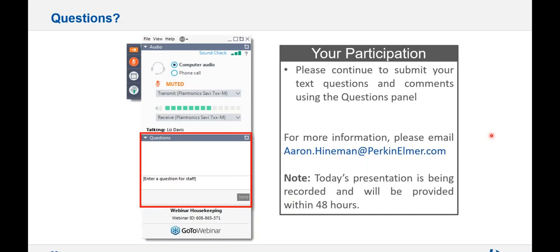They also could help. I'd start with your application person, and application articles can also help. I totally agree. When you get into specifics on an application, you need to know the matrix and the concentration levels. There's a variety of factors that need to be considered.